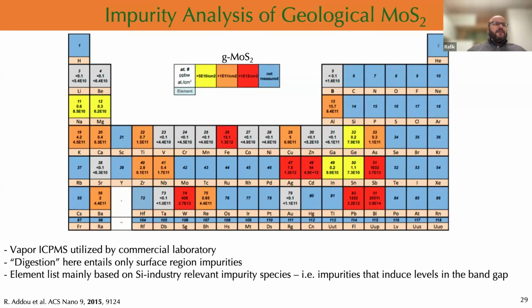So we did the ICP-MS technique, with which we can get the concentration in parts per million or parts per billion. We used the company Balazs Lab. We sent them different samples, because they work a lot with the semiconductor industry, so they do this a lot for companies. They use silicon for that. This is why they pick only the elements they study for the semiconductor industry, and they don't pick the elements that the semiconductor companies don't care about.